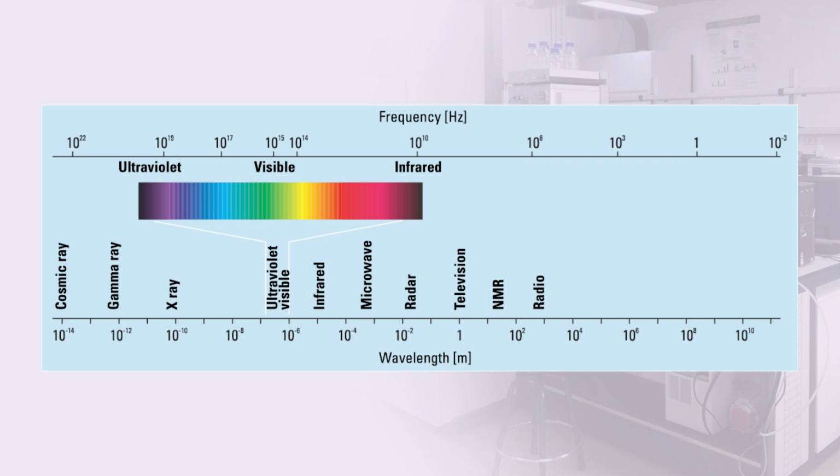But if ultraviolet or visible light is falling, then there will be an electronic transition, and we will see the color or non-color. That means within the atom, the electrons will move from one orbital to another orbital. If we go further, to higher energy like X-rays, then of course we can attack even atoms. Gamma rays and X-rays can knock an electron out of the element.